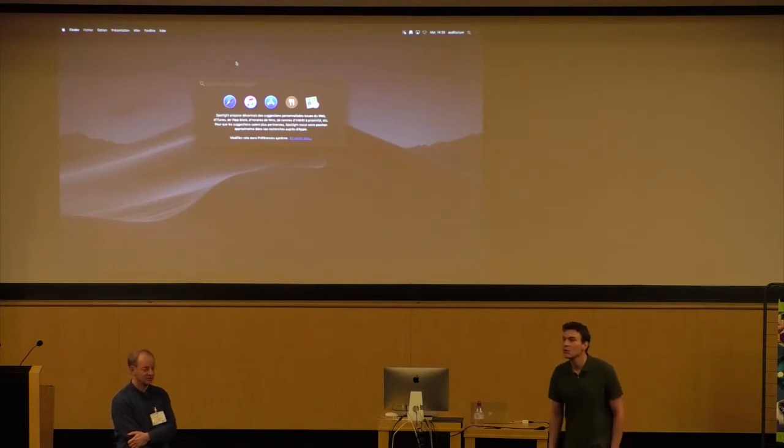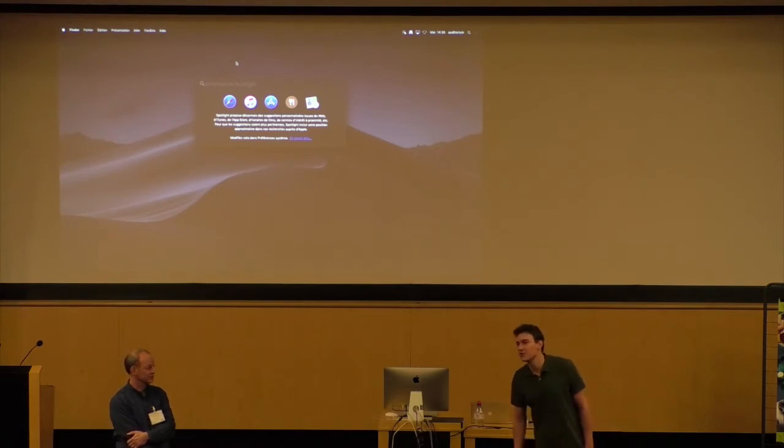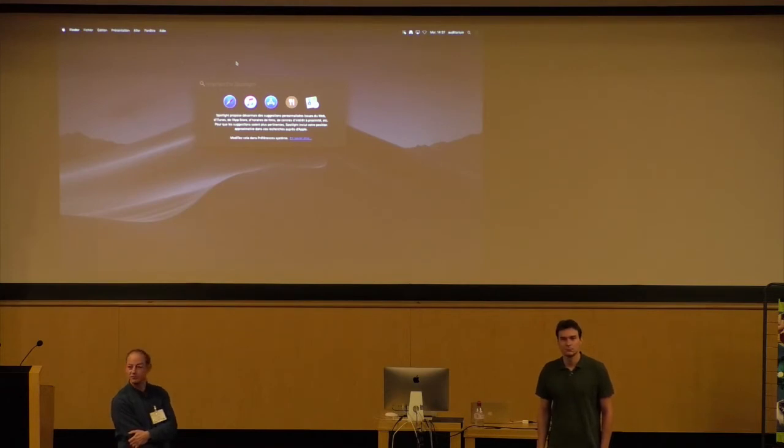Have you tried it in a cartridge, in a Theos cartridge? So if you have the grid already loaded in a ring. Yeah, but not me. I was another student, but by plunge freezing it's hard to really have nice vitrified ice. So for having clipped grids, maybe you need to have this ethane jet or something. So, some more questions?